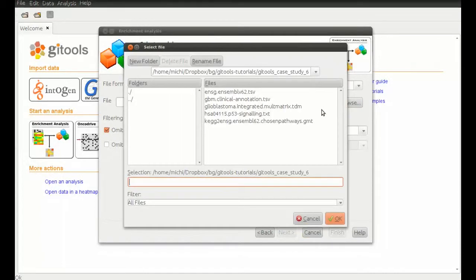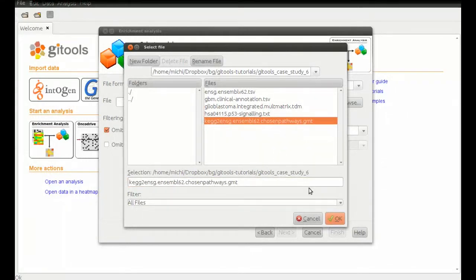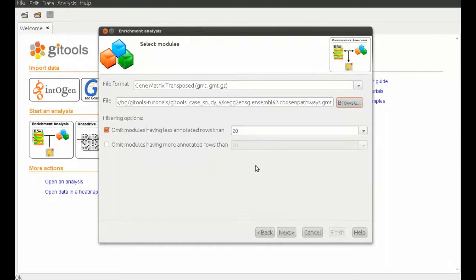In the module selection, we want to load the file that maps the pathways to gene IDs. Each module will be analyzed separately for each sample unless we apply some filtering.